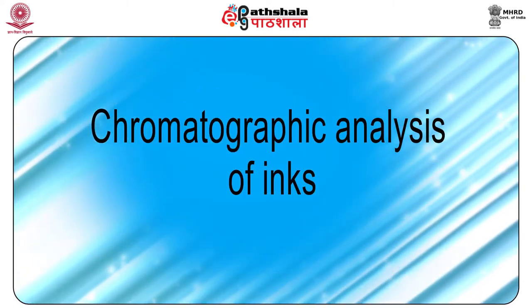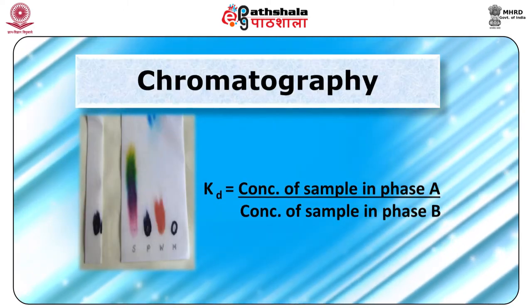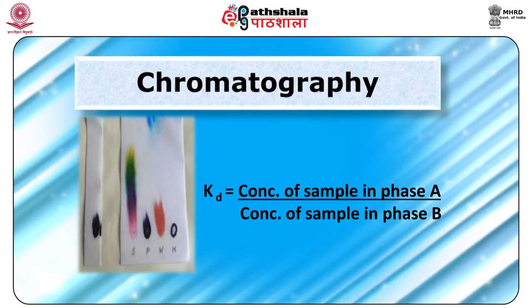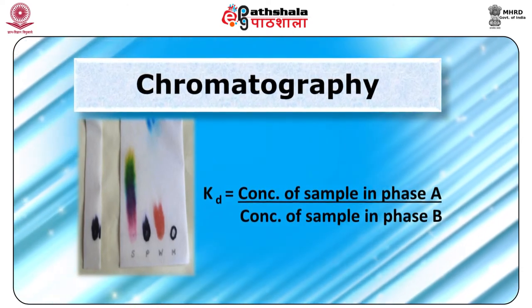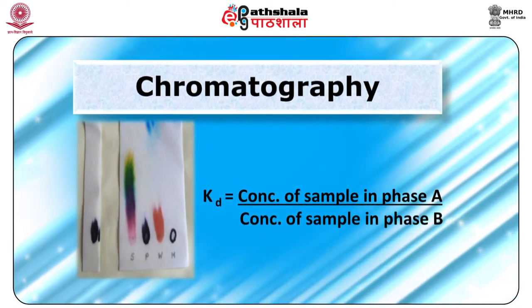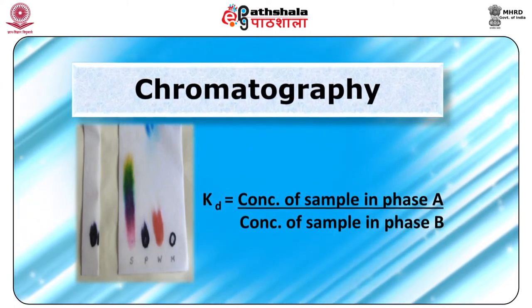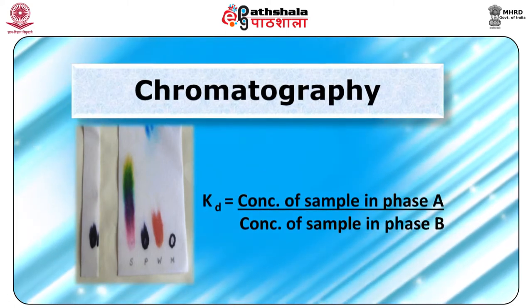Next would be chromatographic analysis of inks. The principle of chromatography is that chromatography is based on the fact that sample distributes or partitions itself to different extent in two different immiscible phases, which is described by partition or distribution coefficient. Now, partition coefficient is concentration of sample in phase A divided by concentration of sample in phase B.